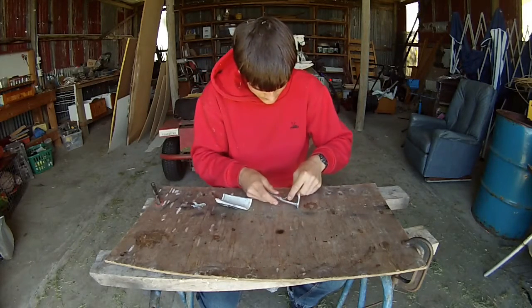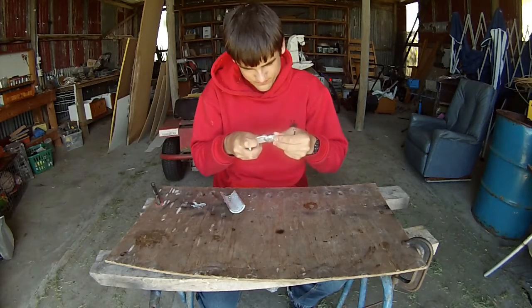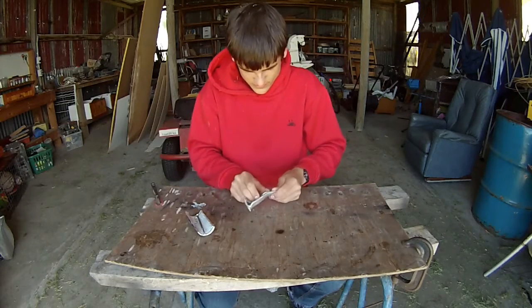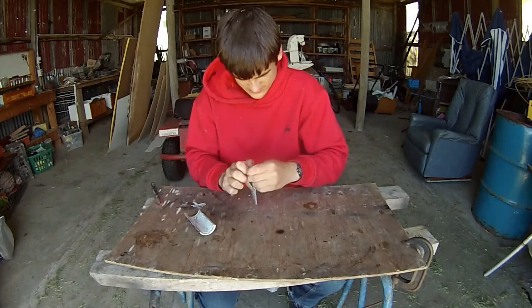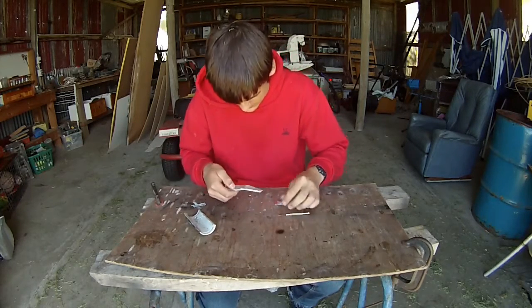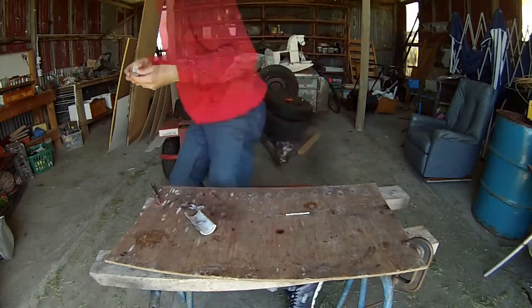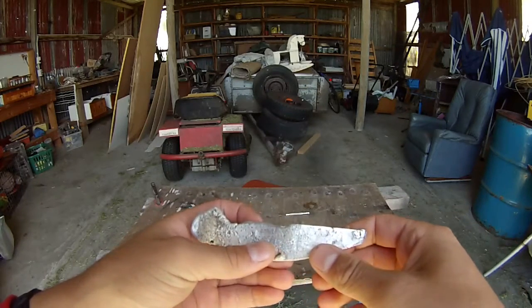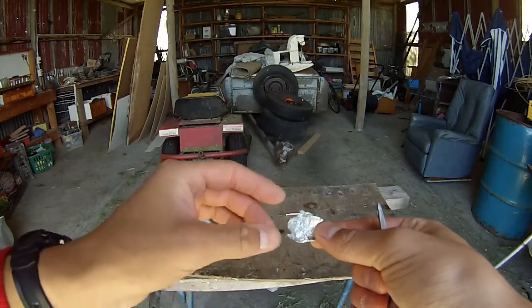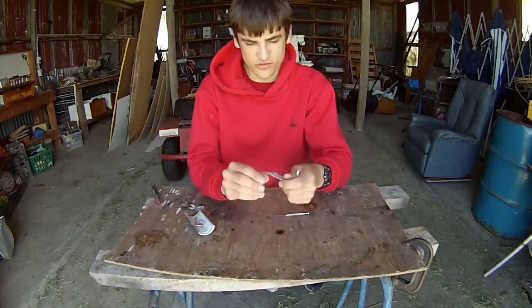Anyway, onto this. It definitely looks like this is fused to that little knife thing here that I made. See if I can snap it actually — no snapping. But this is far out. I think I can't snap it because this is just way too thick. I'd like to get a close-up on that — hopefully you can see that there. It's actually cracked, so that is the alloy that I created with the gallium. There's a bit on there, right there if you can see that. So that's a gallium and aluminium alloy that I have created just now. That is a very brittle alloy.